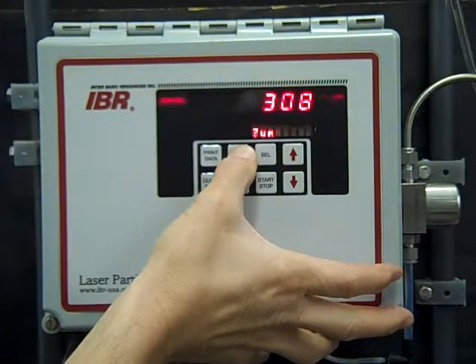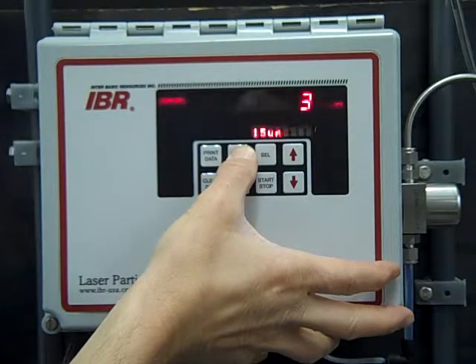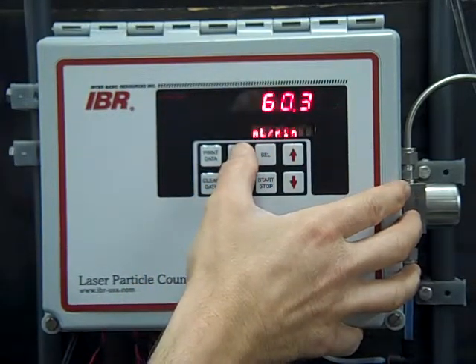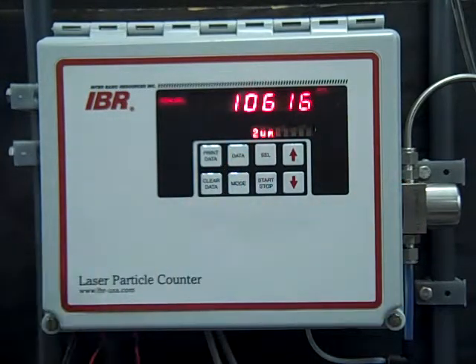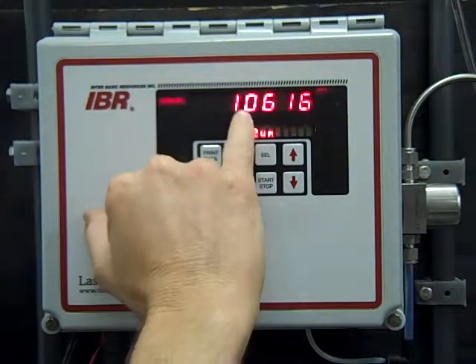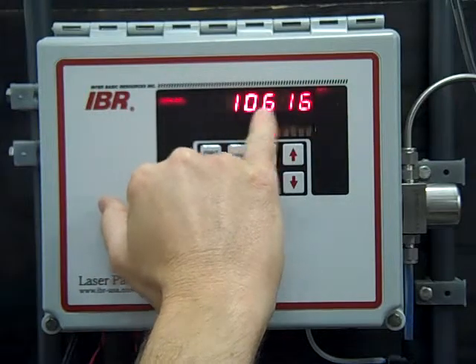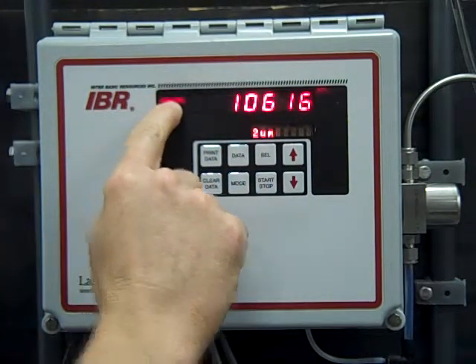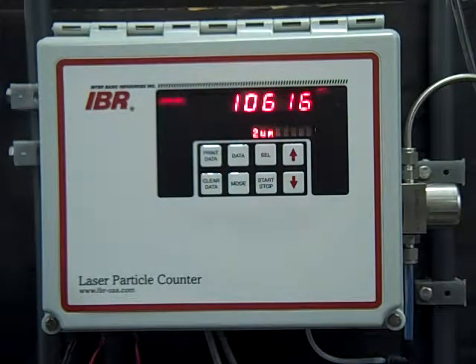And the same goes for all the other counts all the way down the line. Now, if you were to take this number, 10,616, that's the total counts that have gone through the sensor in 10 seconds.